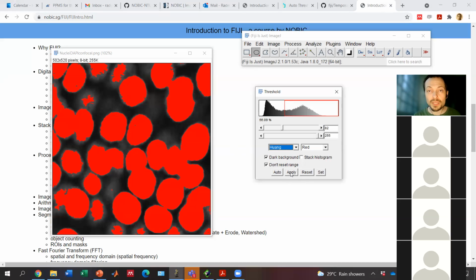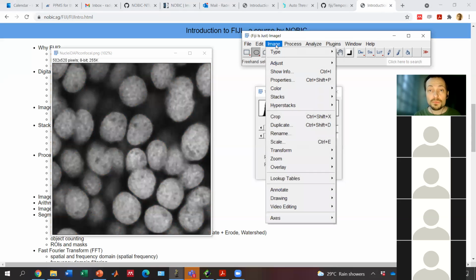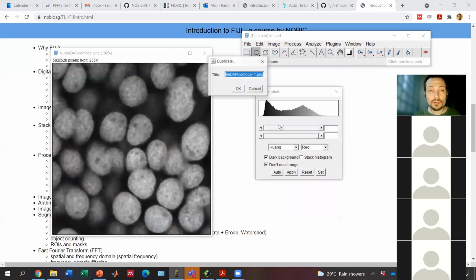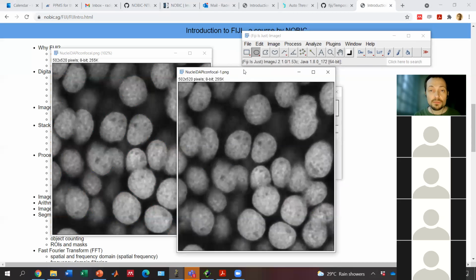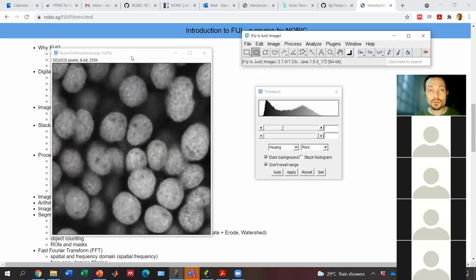And maybe one thing which, again, I mentioned is a good thing to do: you can make a duplicate, in case something goes wrong and we want to go back to this image. We will keep it in store.